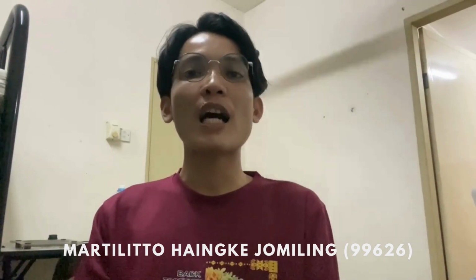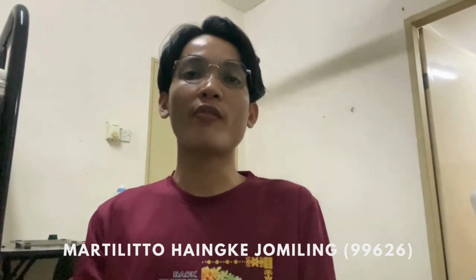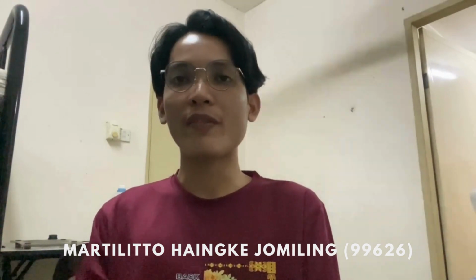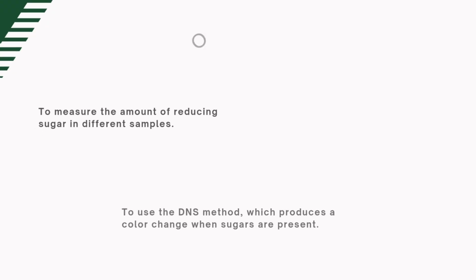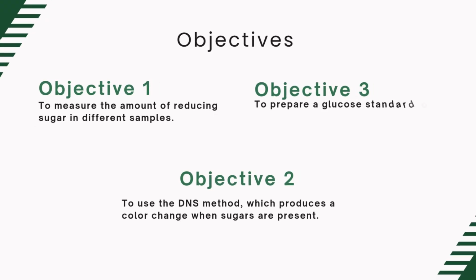So in this video, I'm going to talk about the objective of this experiment and also the reflection part of this experiment. So now we go to the objective part. The first objective is to measure the amount of reducing sugar in different samples. The second one is to use the DNS method, which produces a color change when sugar is present. And the last objective is to prepare a glucose standard curve for comparison.